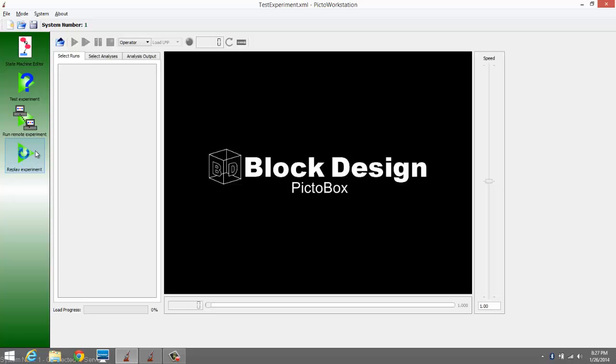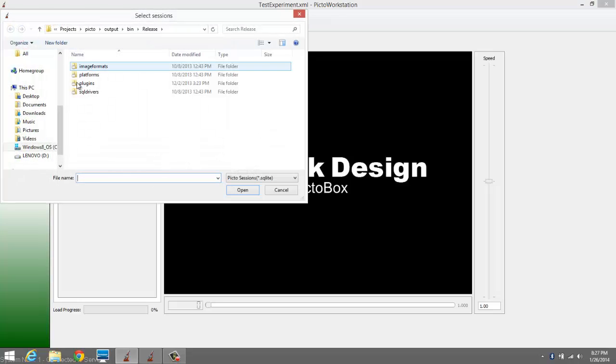So what we can do is we can play the session back, and if we select an analysis, then just like we saw in the test experiment window, it'll just analyze during the course of playback. So let's give that a try now. Here we're going to open up the session that we just recorded.